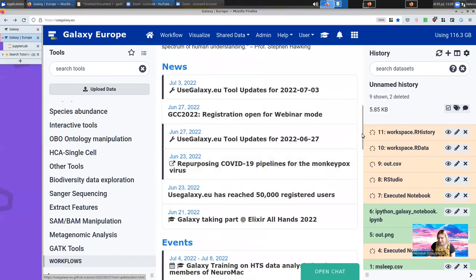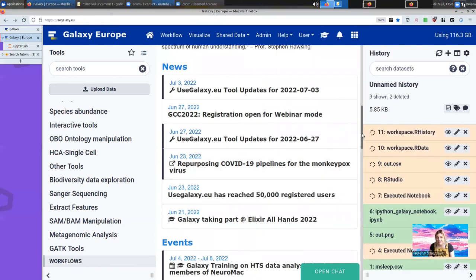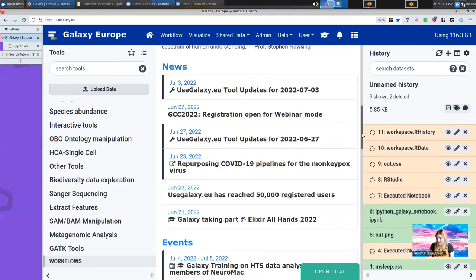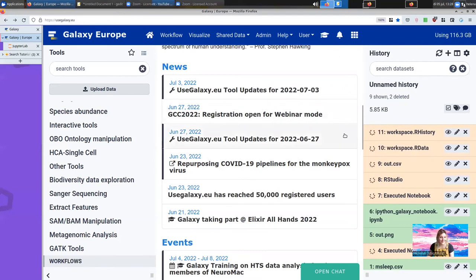With RStudio, you can also install packages. If you're missing anything, just use install packages, or you can use Mamba if they need dependencies as well. But we hope you like it, and give it a try.